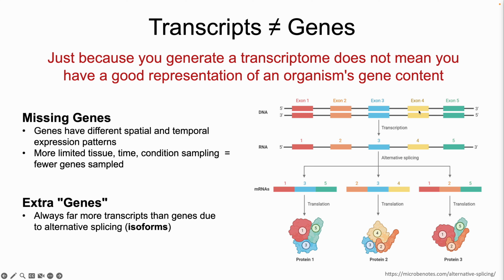In that situation, I don't even know exon 4 exists, okay? And so later on, when I go to start trying to map, and because now I've sampled day 5 larvae, I get some of these transcripts in there. There may be a reannotation step. There may be like all of those reads may not map because I've got paired ends and one of them doesn't align to what I think is a gene. So all of that missing genes or missing exons is another complication.